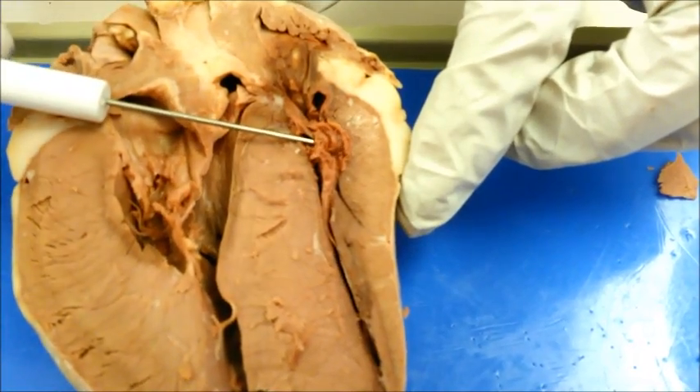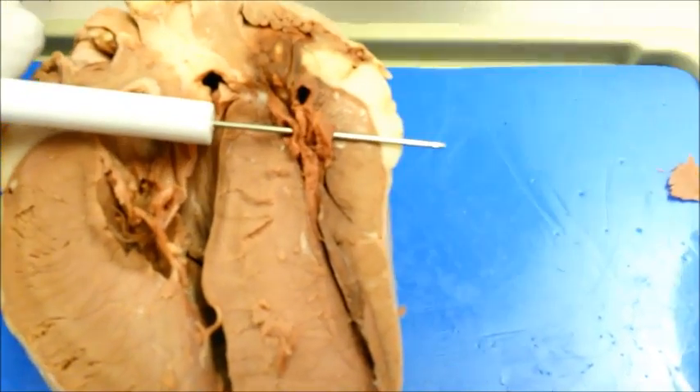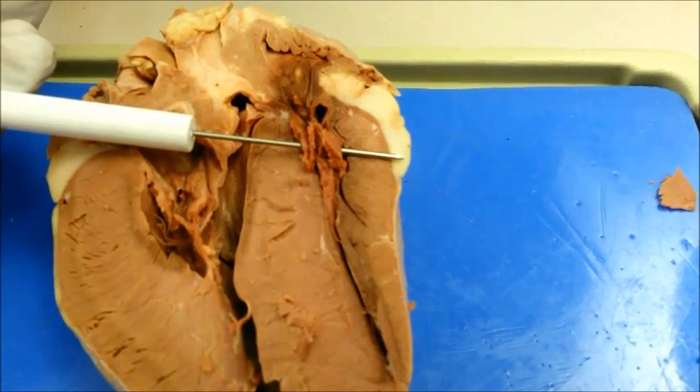The tricuspid valve is an atrioventricular valve located between the right atrium and right ventricle. This valve allows blood flow from the right atrium into the right ventricle.